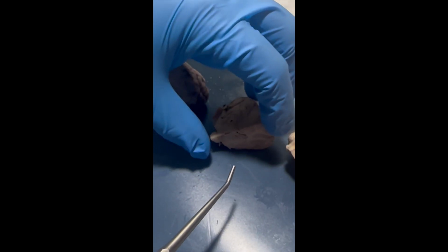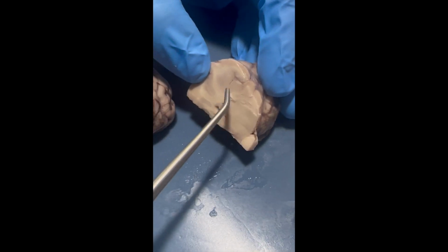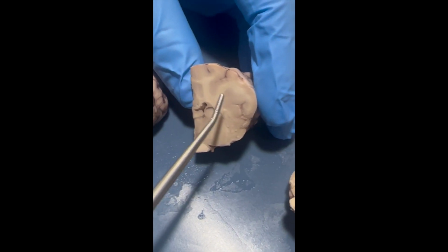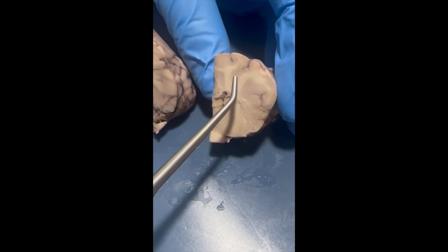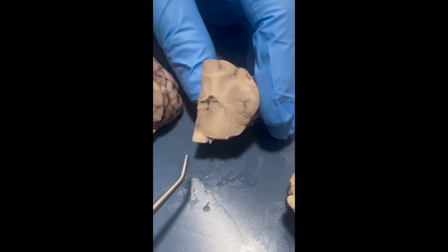Moving to the cross section of the brain that we did earlier, to point out the gray and white matter. The gray matter can be seen on the outside here. It's all this gray. This would be the cell bodies of neurons, and they're all unmyelinated. The white here would be things like axons that create tracts that connect all of the neuron bodies to each other and to the spinal column. These axons are myelinated, and that's what gives them that white color.